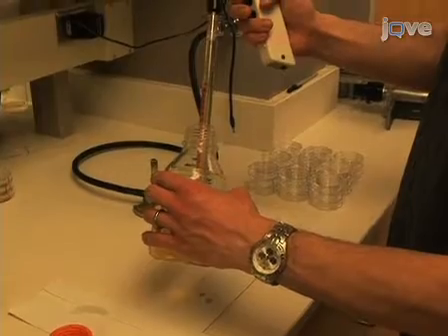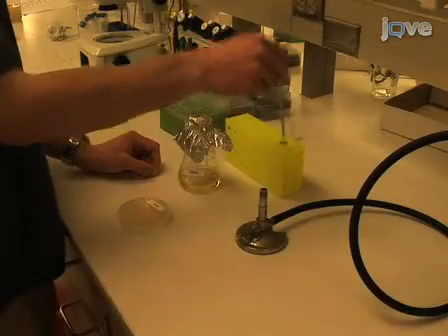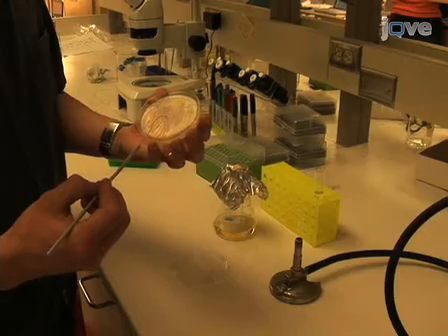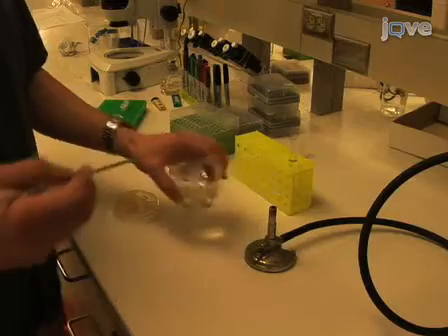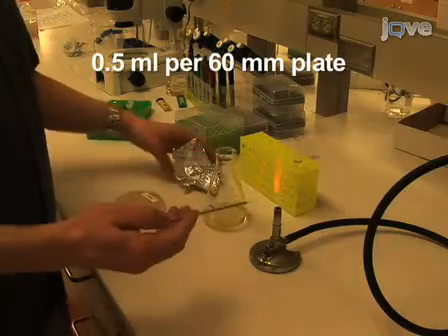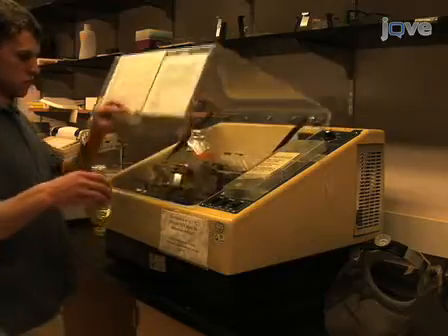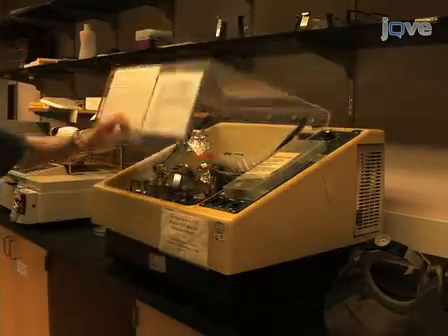Now pour the media and allow the plates to dry on the bench for two days. On the day before the plates finish drying, seed liquid LB culture with a single colony from a fresh streak of E. coli OP50 bacteria on LB agar. Prepare at least 0.5 milliliter culture per 60-millimeter plate.